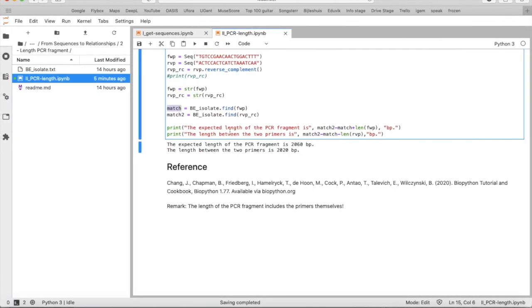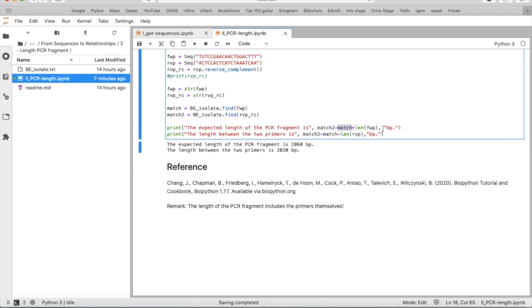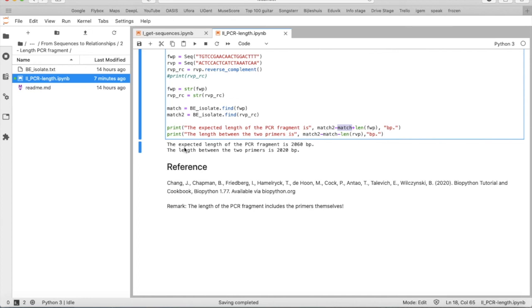And that is something we can put in the print command. So we say the expected length of the PCR fragment is match 2 minus match, plus the length of the forward primer base pairs. So we get the expected length of the PCR fragment is 2,060 base pairs. And the same with the length between the primers, match 2 minus match, minus the length of the reverse primer base pairs. And so we get the length between the two primers is 2,020 base pairs.